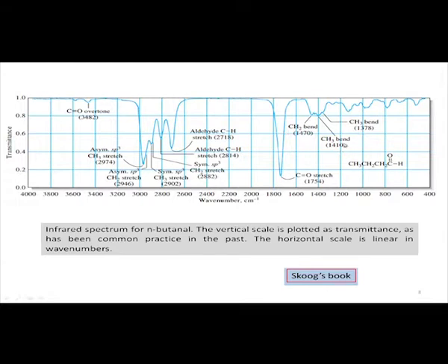So, they are mostly for the CH3 and CH2, not for the stretching mode, but for the corresponding bending mode of activation.